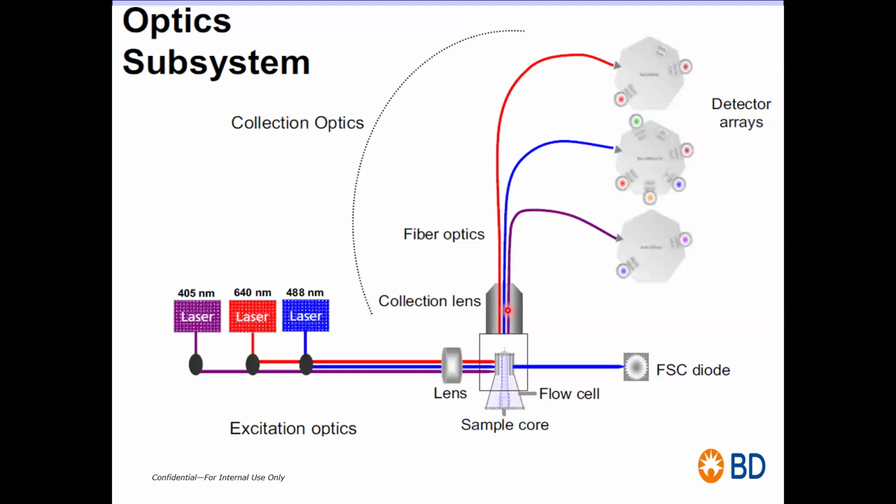And you must have learned in your physics that optical fiber has a property that it lets the proper light signal pass through it. And these are your laser detectors, violet, red, and blue. So that's why they are, as you see, a bit far away from your interrogation point. So you need some strong detector to detect those signals, so you won't lose anything.